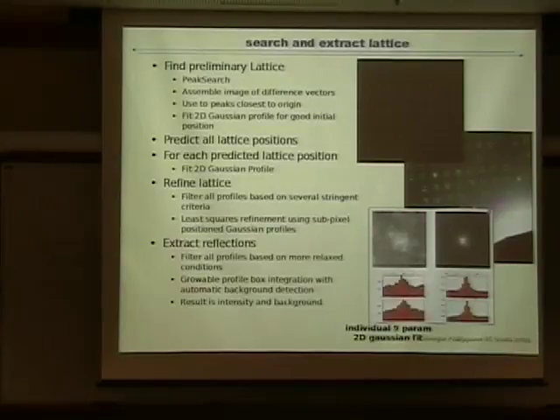So that's where the strength of the program is, that you can start to work with these types of things. That would be very powerful if you could use these detections. So this profile fitting is like our first implementation, and I anticipate these problems will come along, these pathological cases. Well, pathological in the sense that it's very difficult to process them right now. Not pathological that you cannot use them, but just that it's difficult to process them. And then we will see what we can do. Or maybe you will hire two smart programmers.